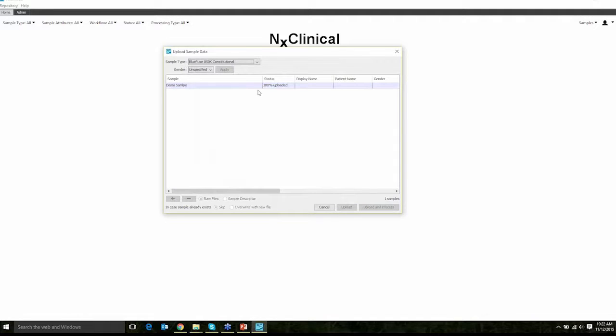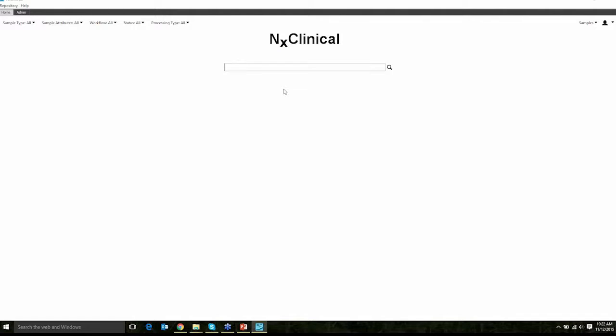You can see that sample just got uploaded from my client onto the server, and it's being processed on the server. So that could be the job of one person, just to upload that. We could even automate that process.